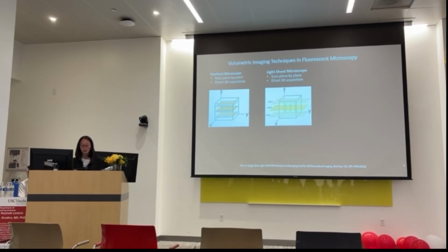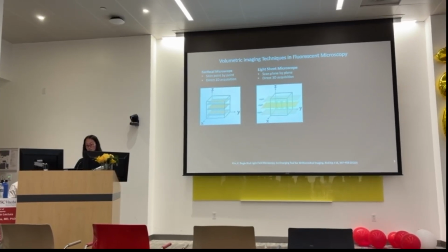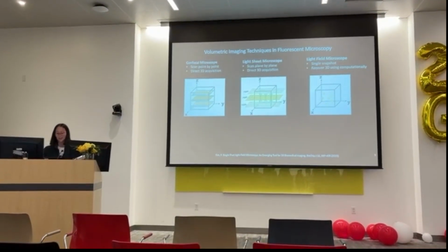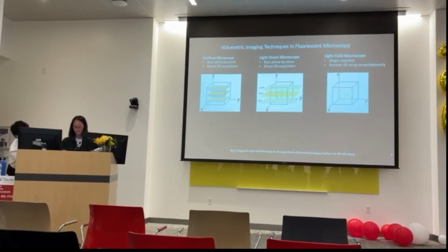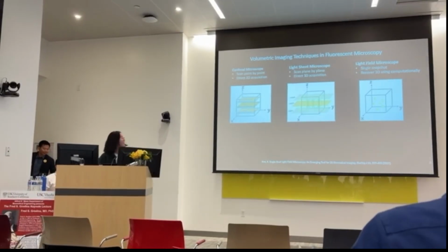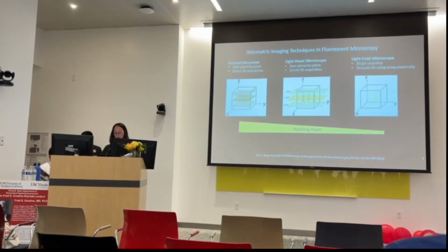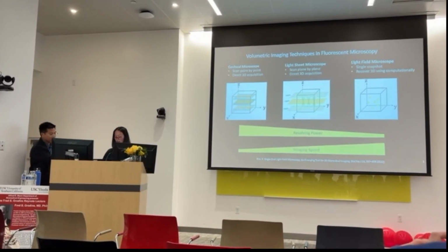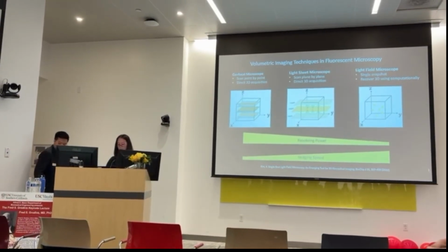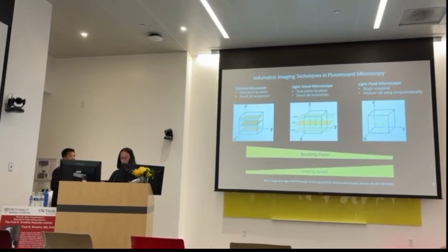While these strategies render high resolution images, they are inherently slower, and most are not suitable for imaging moving structures such as the heartbeat or fast neural dynamics. Light field microscopy, on the other hand, acquires the 3D information in a single shot without scanning, and uses computational methods in post-processing to recover the 3D volume. Although compared to confocal and light sheet, light field has less resolving power, the volumetric imaging speed will increase significantly, which is very powerful for capturing fast dynamics changing in 3 dimensions.